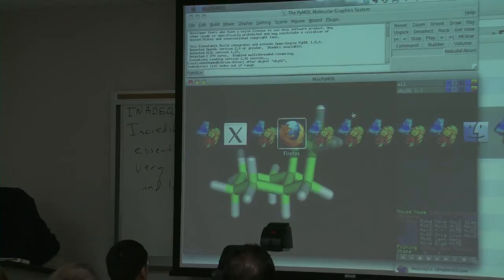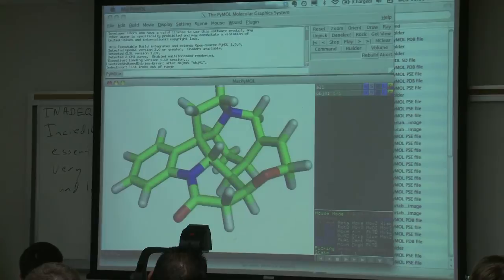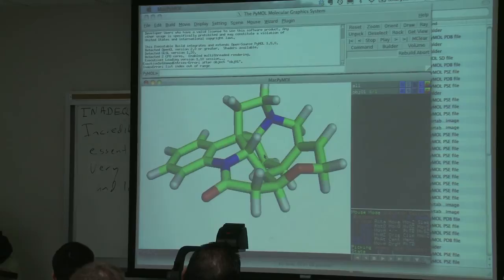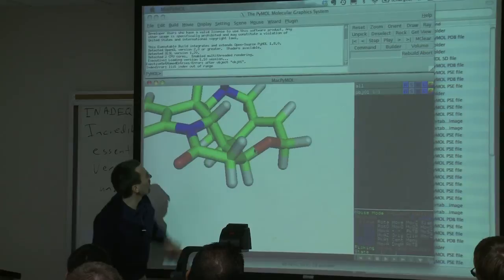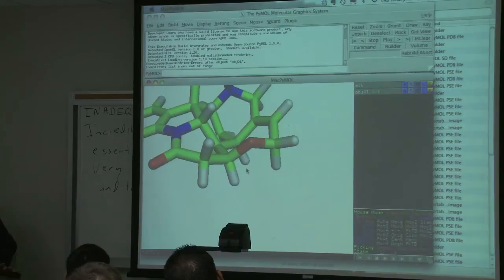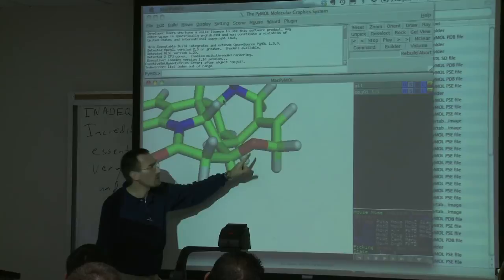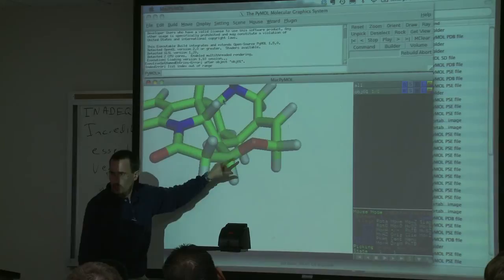Last thing I'll do is let me just show you how these fit into a couple of things. So here's our strychnine molecule. You've all modeled this. And you notice on the seven-membered ring, here I'll bring it over. Here you can see the seven-membered ring, even though we have an oxygen in it. Even though you have an oxygen embedded in your seven-membered ring, you can see this chair-like structure. Even though you have a double bond in it, an oxygen in it, you've got your three axial hydrogens. So that's going to influence your thinking as you start to assign your protons and assign your stereochemistry.